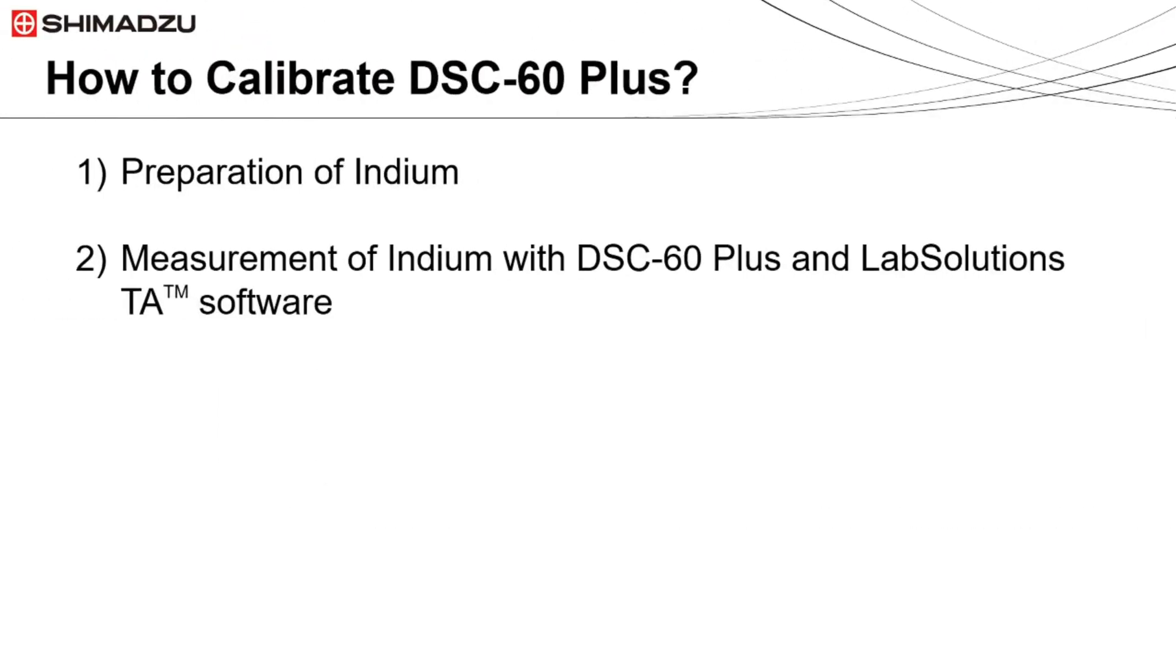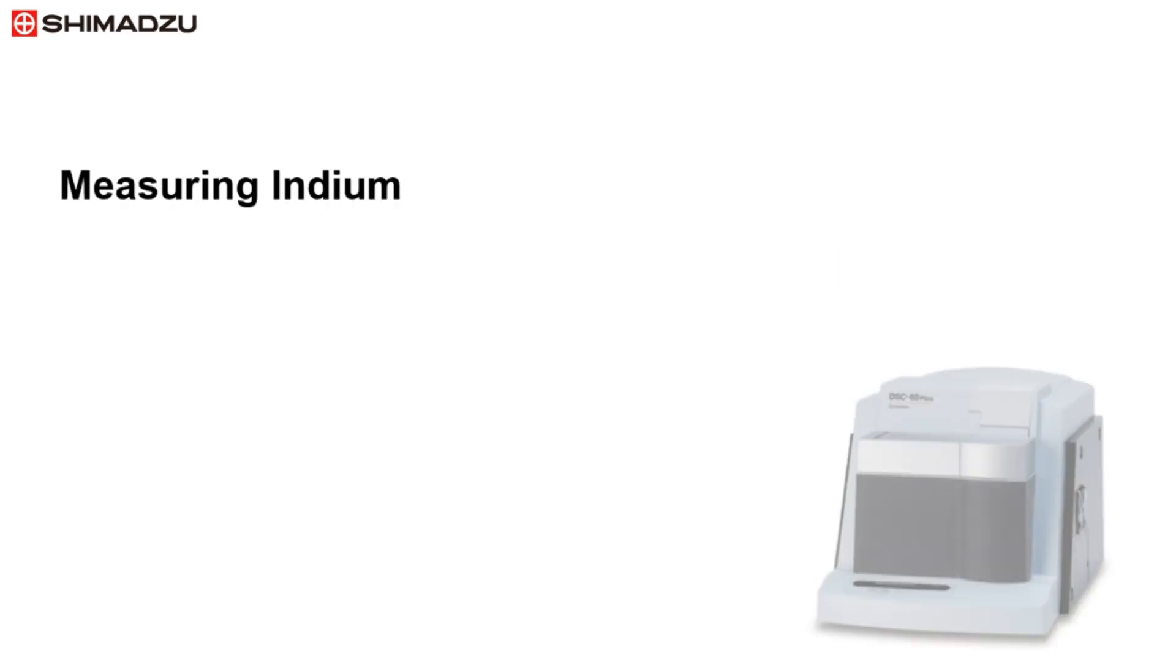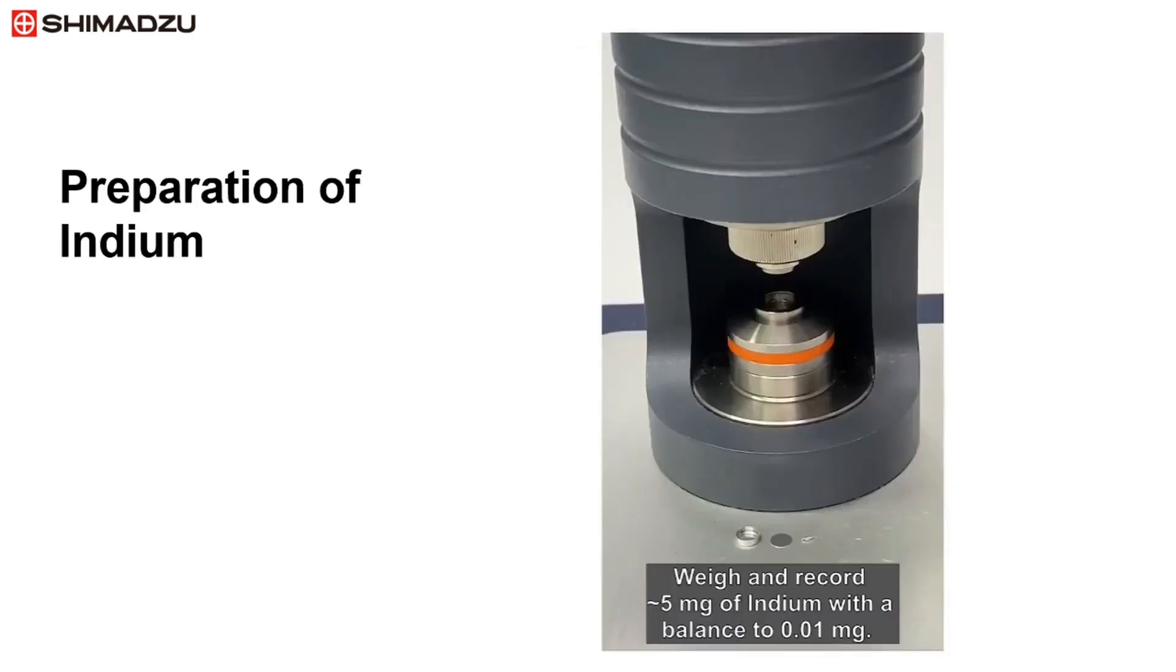To calibrate the DSC-60 Plus, the indium is prepared first. The indium is then analyzed with the DSC-60 Plus together with the LabSolutions TA software program. Next we will show how to analyze indium with DSC-60 Plus.